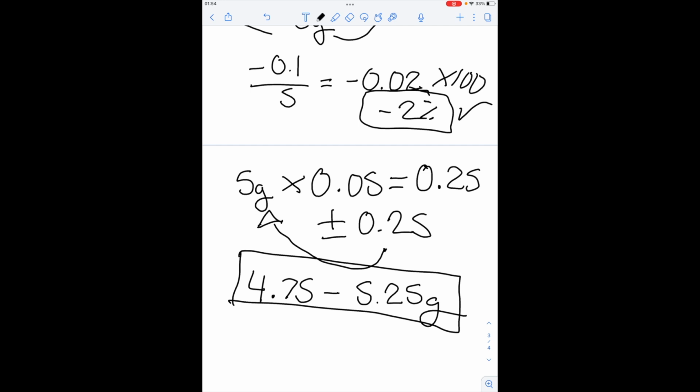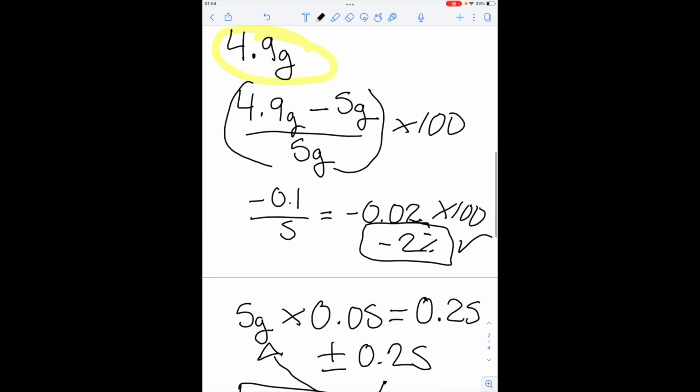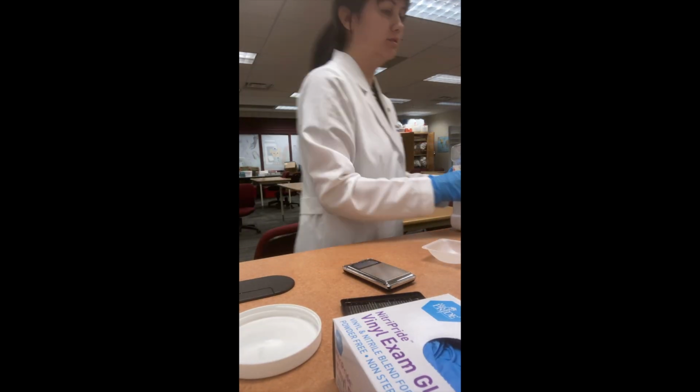And remember, we measured 4.9 grams. That was our original measurement. We were trying to figure out if that would check out. So as you can see, 4.9 grams would fit in this range, so it checks out. All right, so salt is done. Let's do flour now.